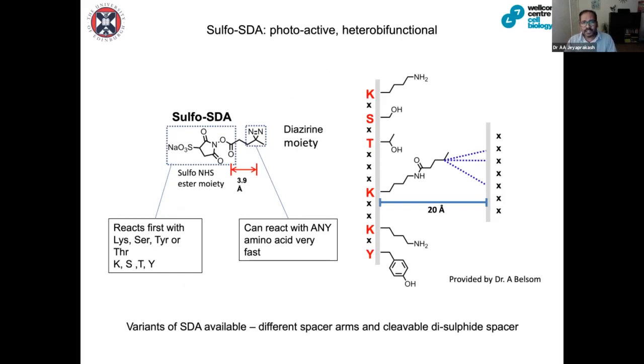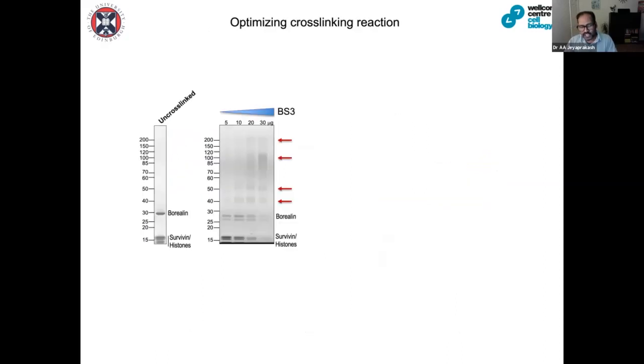In a typical cross-linking experiment, one has to perform a titration experiment, varying the amount of crosslinker in the cross-linking reaction. And one might also need to change the amount of sample used in the reaction. Oftentimes, one also has to vary the buffer conditions. Once the right condition where the cross-linking is efficient is identified, you make replicates of this reaction and analyze them on the SDS-PAGE, cut out the band that corresponds to the cross-linked species, do the digestion, and go for mass spectrometric analysis.